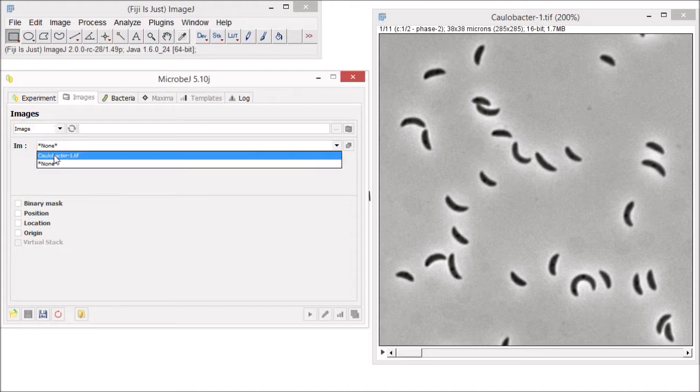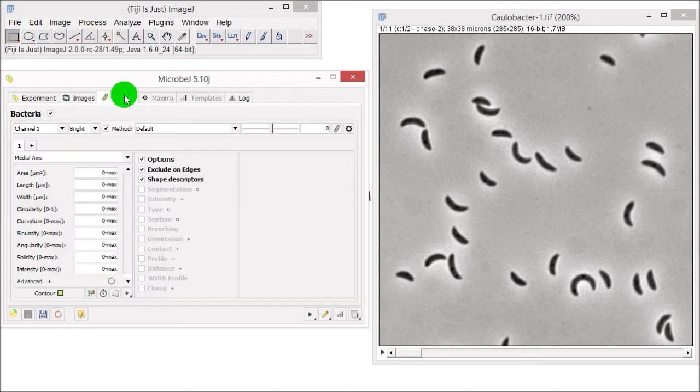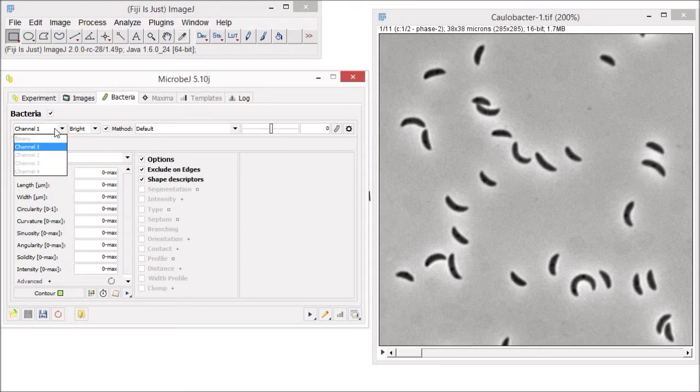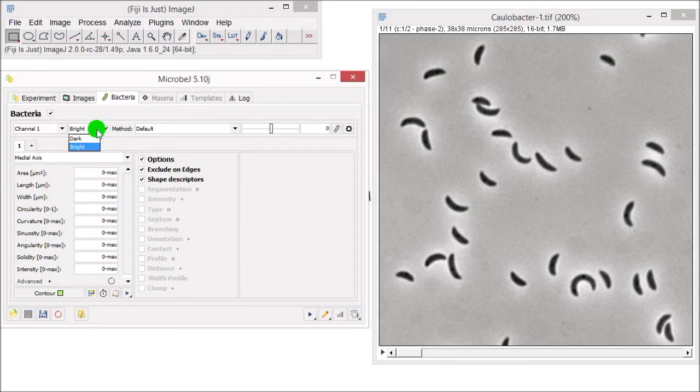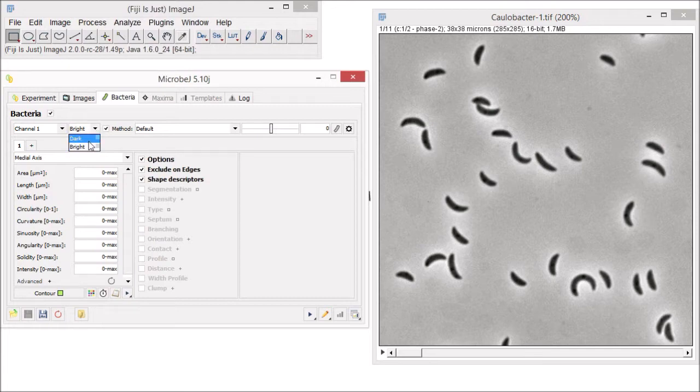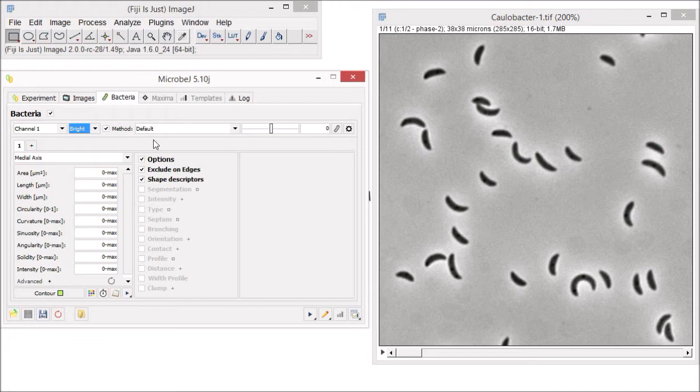Now go to the Bacteria tab. In this panel, we will select the channel of interest. In our example, we only have one channel. Next, we will select the type of background. In this case, the background is brighter than the particles of interest, so let's keep the bright mode.